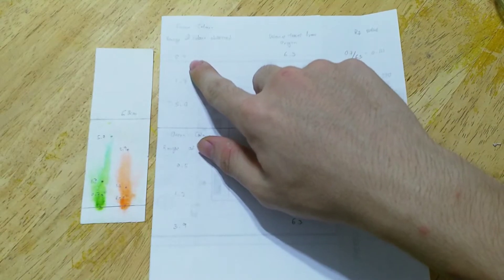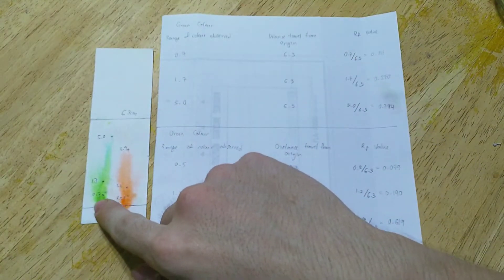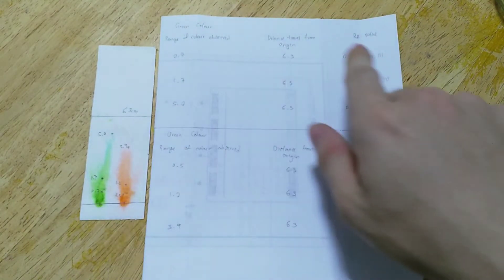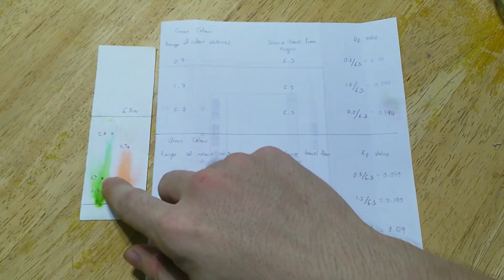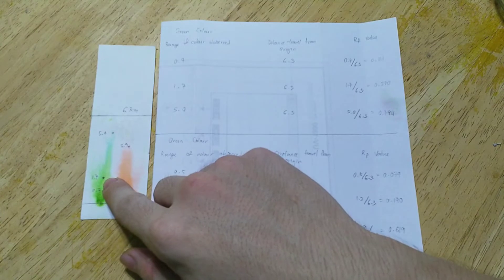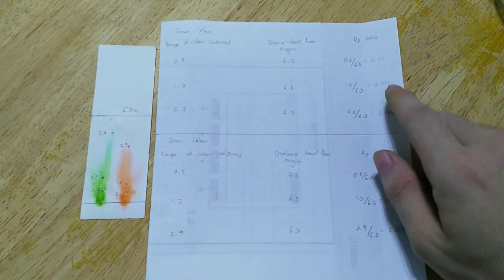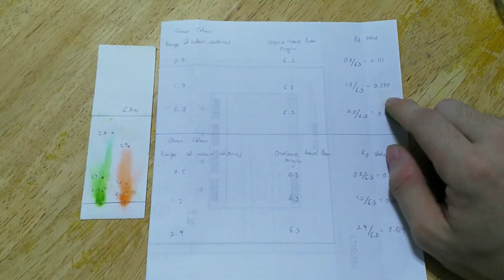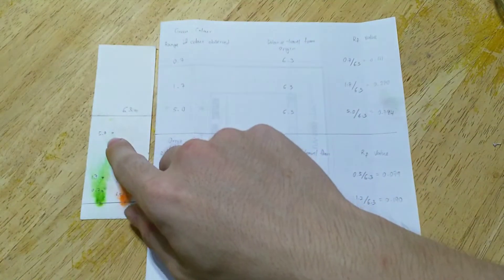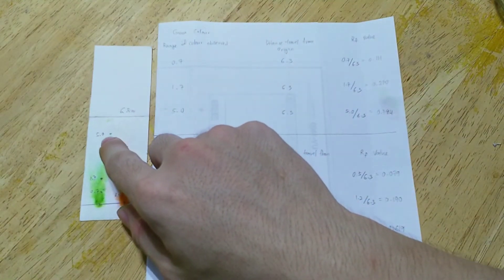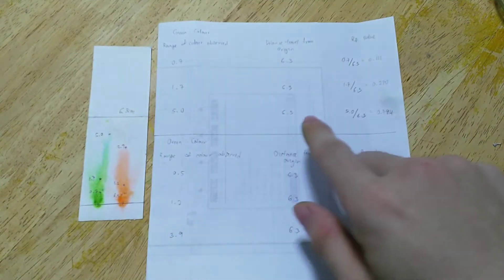And for the first range which from here the green color is 0.7, the RF value is 0.111. And range for the green color 1.7 is the range, the RF value is 0.27. And the third distance for the green color is 5cm and the RF value is 0.794.